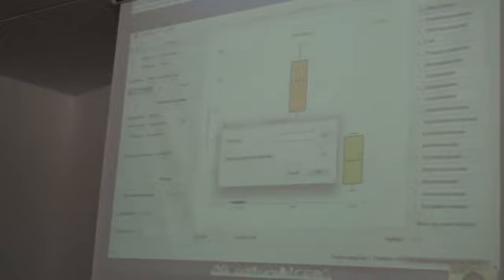So now we're going to load in that file along with the same map file that we had before. And an error, that's not good. I think it sometimes gives me an error when I already have data loaded in, but I think it's fine. So again, now we have different profile levels, just like we did with the OTUs, and level 3 is the actual pathway information.